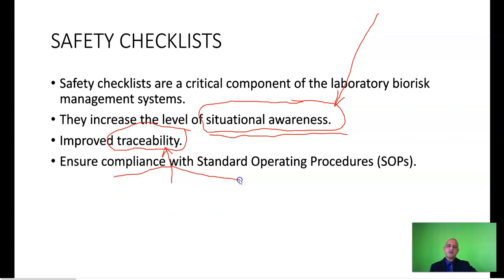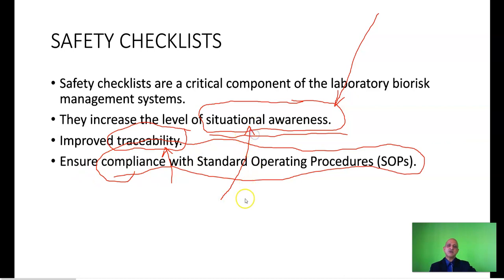And you also have to comply with standard operating procedures. Please take note that all facilities may or will be audited periodically, and the auditor will definitely require your checklists for examination. So please maintain your checklists. Ensure that they are stored both in electronic format by scanning the documents as well as in hard copy or printed format. And they should be filed, and these are controlled documents.